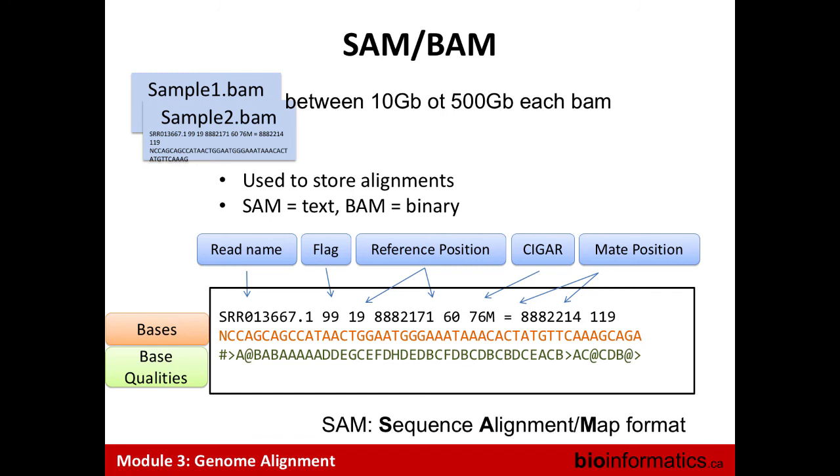Is it a global alignment or local? Like, does it try to match the whole sequence? It's not quite the same as local and global. It's more for DNA. It's more trying to look for global alignment, but it should be able to tolerate some gaps. So it's a kind of seed extension that we do on a global alignment.